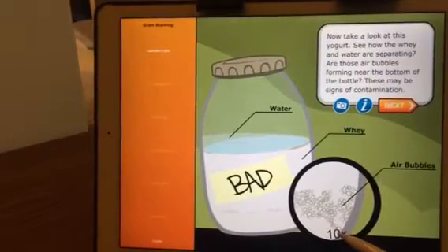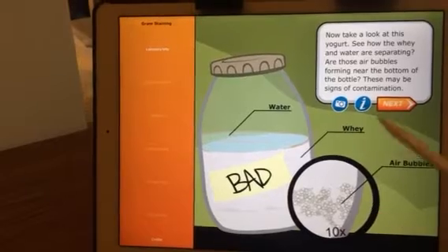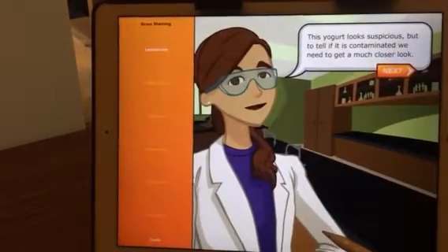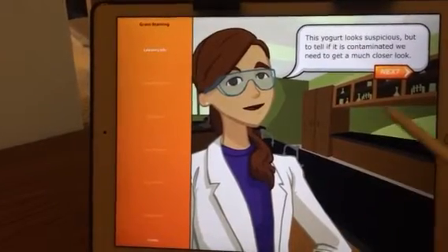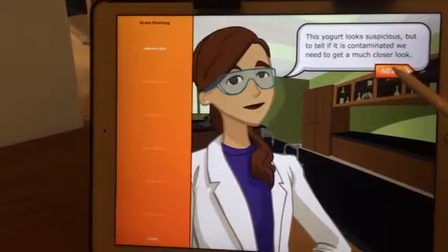Now take a look at this yogurt. See how the whey and water are separating? This yogurt looks suspicious. But to tell if it is contaminated, we need to get a much closer look.